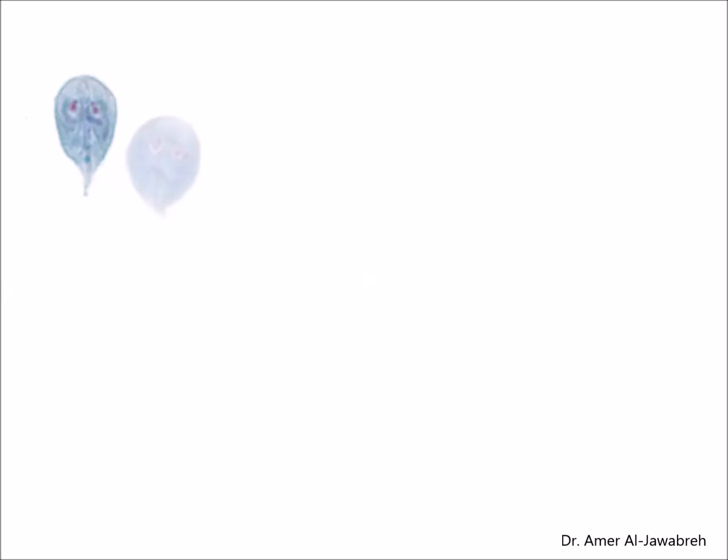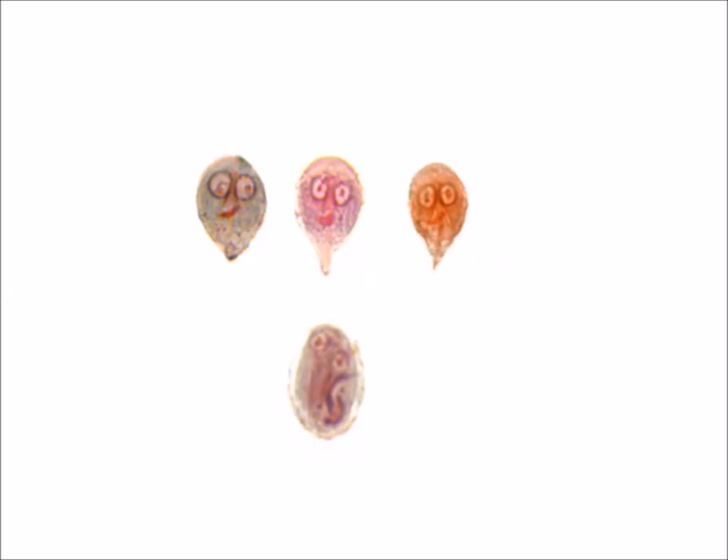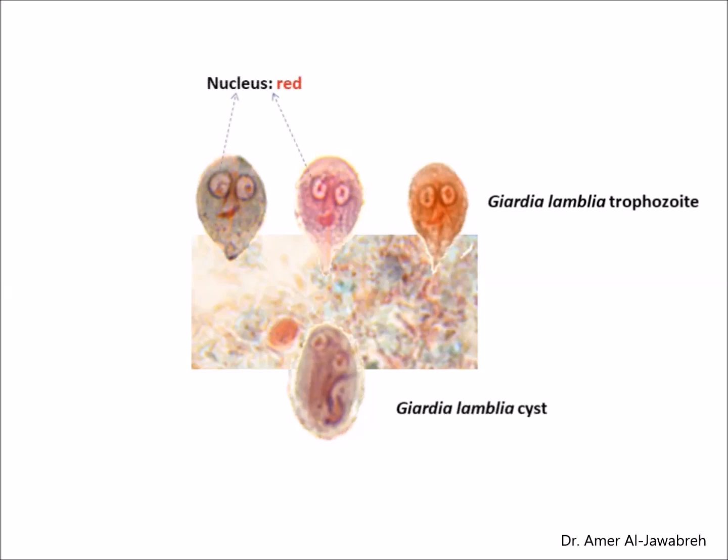The cytoplasm of protozoan trophozoites will appear blue-green, sometimes with a tinge of purple. Cysts will appear slightly more purple. The background material usually stains green, providing a nice color contrast with the protozoa. Nuclei and inclusions such as chromatoidal bars of Entamoeba species, RBCs, bacteria, Charcot-Leyden crystals, and the median body of Giardia will all appear red, sometimes tinged with purple. However, ideal conditions may not prevail every time, and protozoa or background may tend to be orange or light brown; this is left to your judgment as to whether you are still able to give proper identification of the parasite.